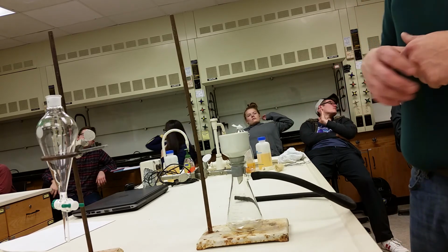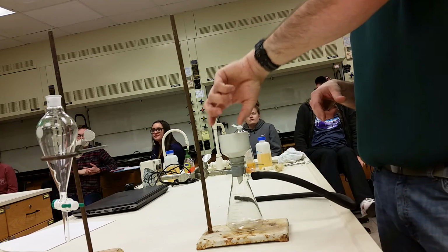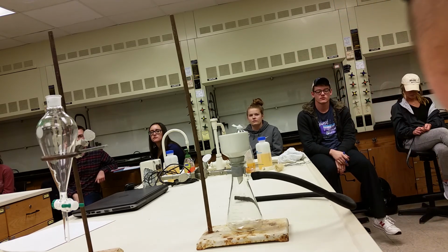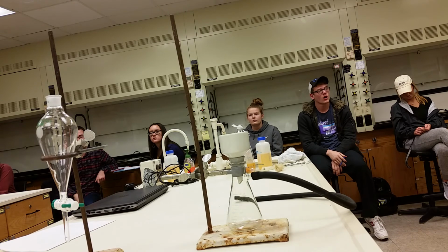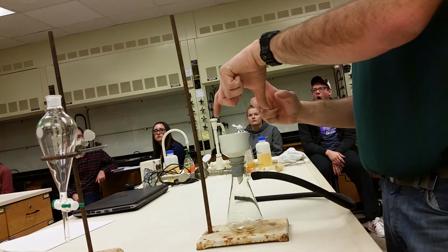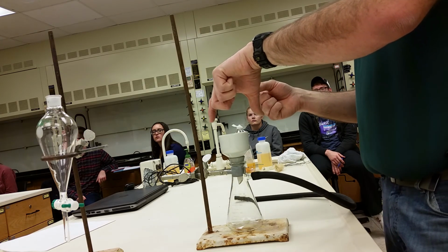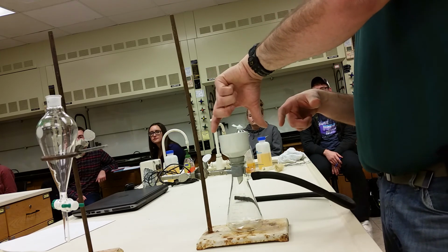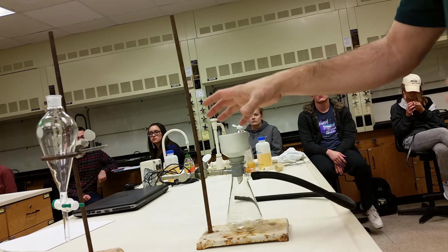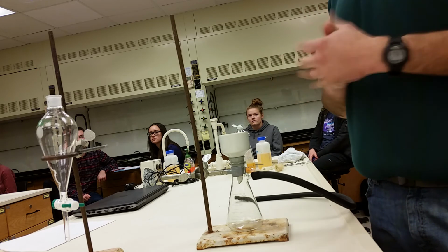Once the vacuum's on, it'll pull the filter paper down. You pour your solid on there. In order to get a quantitative transfer, there's a squirt bottle of water running around here. You squeeze the squirt bottle of water, it will send water into the Erlenmeyer flask, and then it transfers all the compound here. Once you've had everything transferred over, let the vacuum run, and that will help dry your solid.